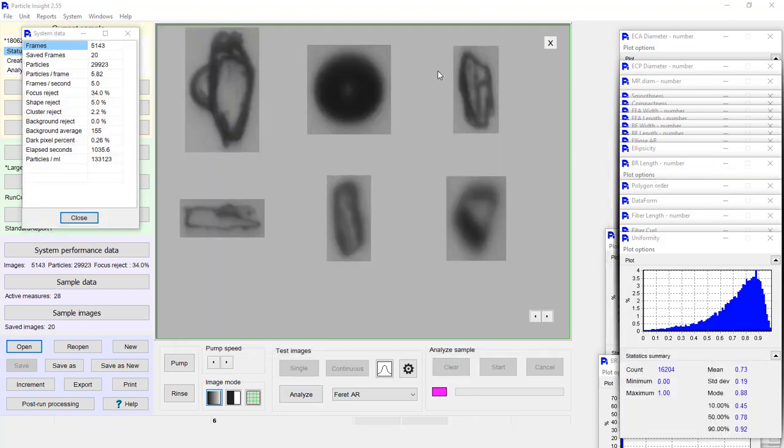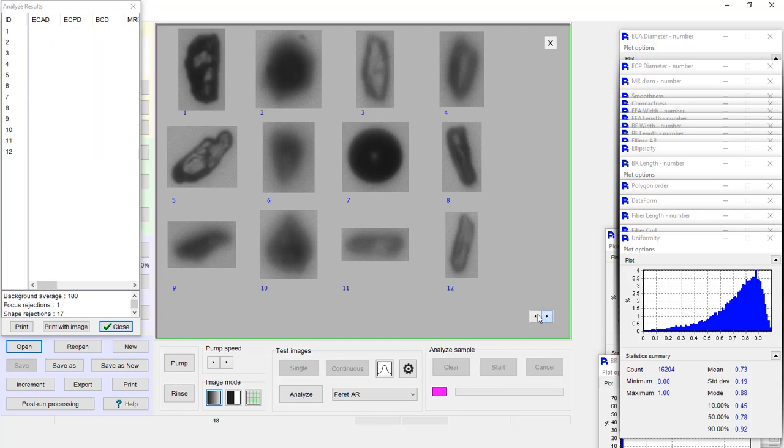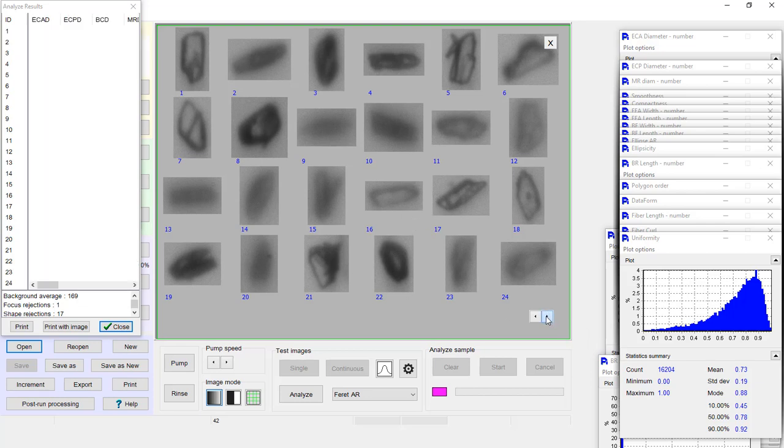So obviously my parameters were not that great, because these are short fibers, but they're actually pretty wide. I think what I did is I chose an aspect ratio that was pretty short. And that makes sense. By having a lower aspect ratio, I thought they were going to be shorter, but obviously that doesn't necessarily mean that's the case. It could be long, but they could be wide. So it's just by aspect ratio where I limited it.